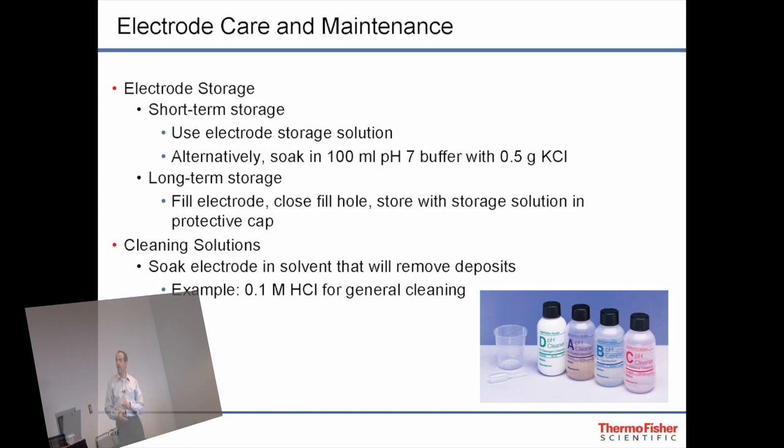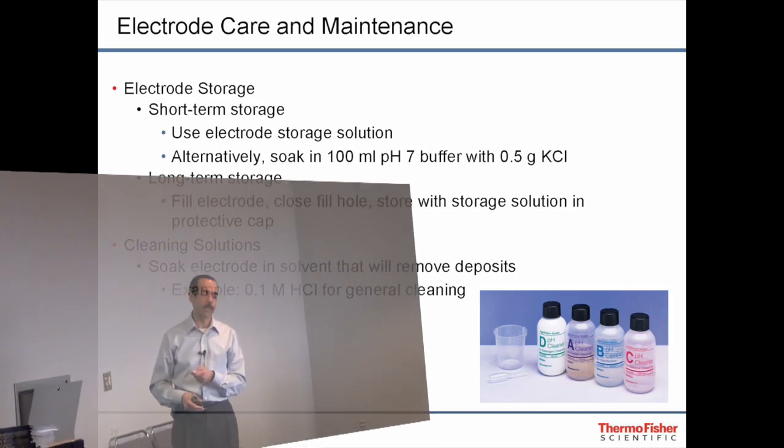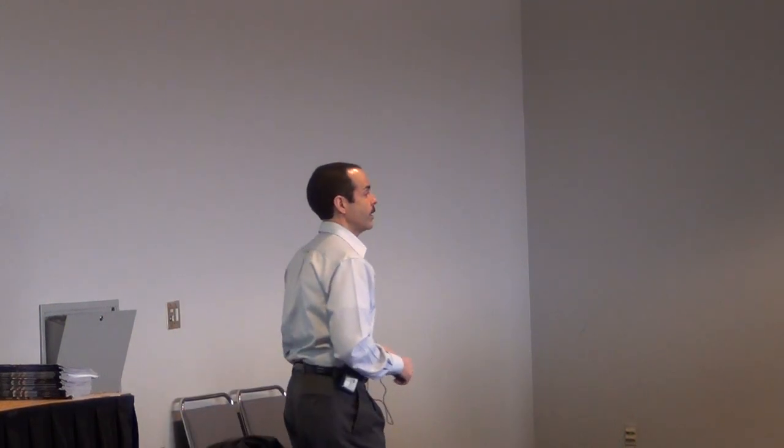So never store it in water, always store it in an electrode storage solution or a pH 7 buffer that has salt added to it, half a gram of KCl for every 100 mils of buffer, or even just a pH buffer is better. Never store it just in water.